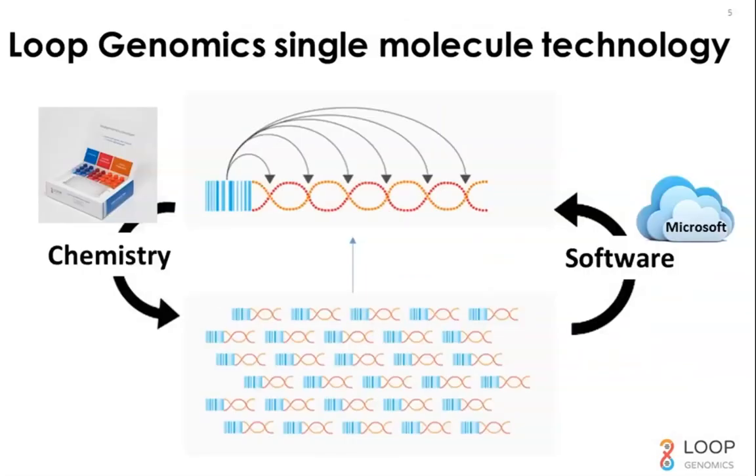There's nothing about our de novo assembly of the long reads that is 16S specific. The pipeline for assembling 16S molecules is identical to assembling RNA molecules or genomes. We don't need to know what the sequence is. Maybe Nick, you have something to add about that, but we're generating FASTQ files, and then the downstream classification is done completely independently.